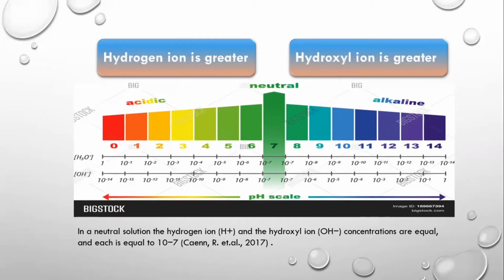The relationship between hydrogen ions and hydroxyl ions in a given solution is constant for a given set of conditions. Either one can be determined by knowing the other. Thus, pH is a measurement of both acidity and alkalinity, even though the definition is a selective measurement of hydrogen ion activity. pH is a logarithmic function. A change of 1 unit of pH represents a tenfold change in hydrogen ion concentration.